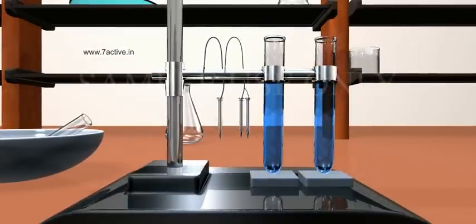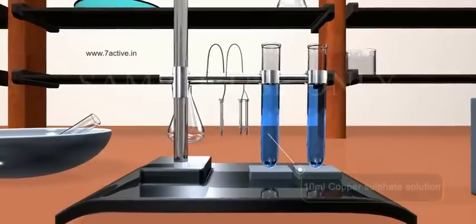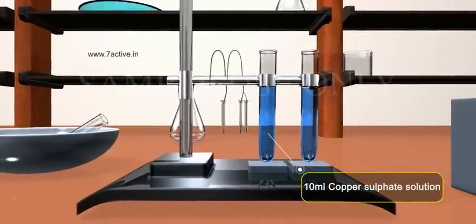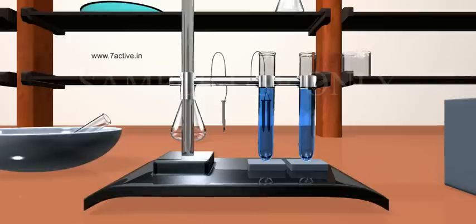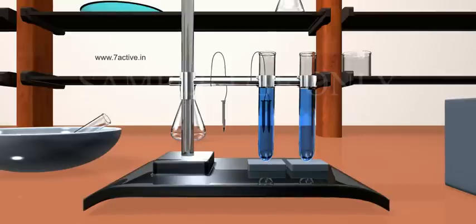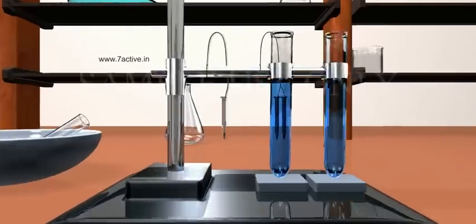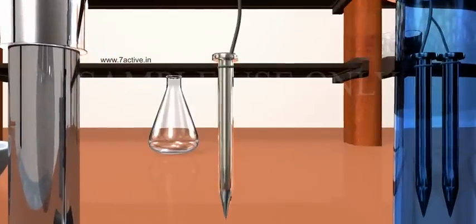In each test tube, take 10 ml copper sulfate solution. Tie two iron nails with a thread and immerse carefully in the copper sulfate solution in test tube B for about 20 minutes. Keep one iron nail aside for comparison.